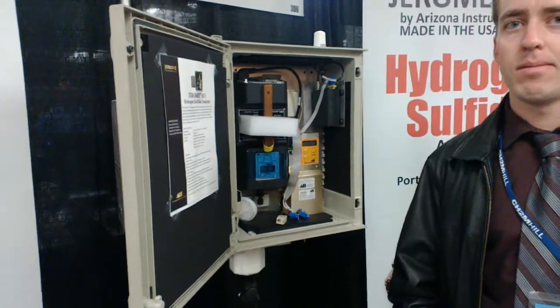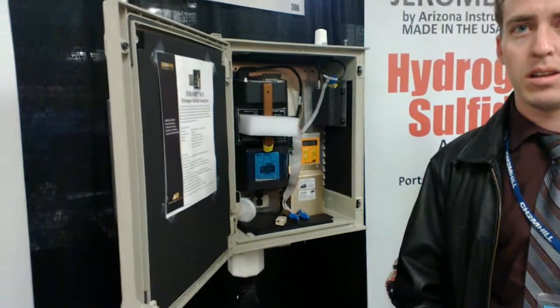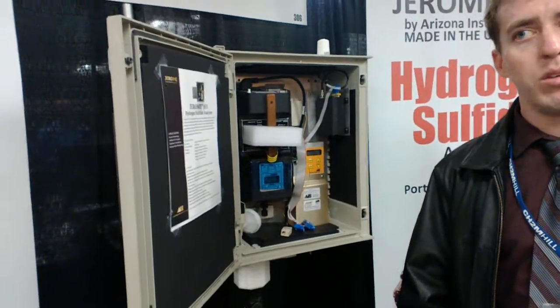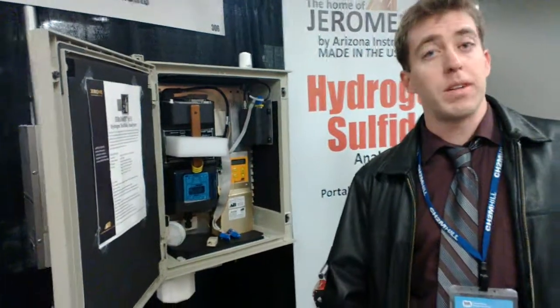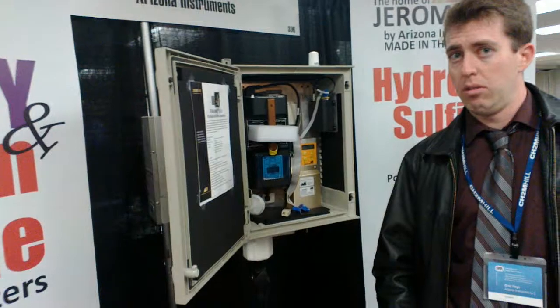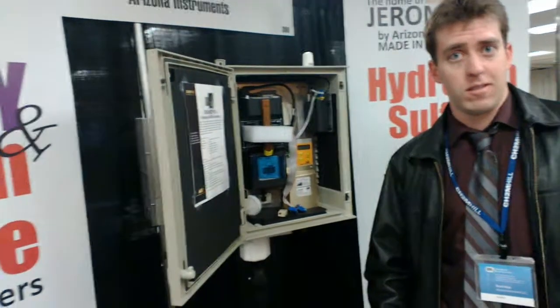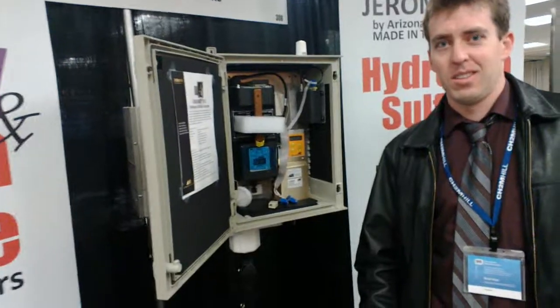How often does it take a measurement — every minute, every 10 minutes, every hour? You can have it do every minute, every five minutes, 10 minutes, 15 minutes, 30 minutes, an hour, or every two hours. You can tell it what you would like. That's a very good idea. Congratulations. Thank you.